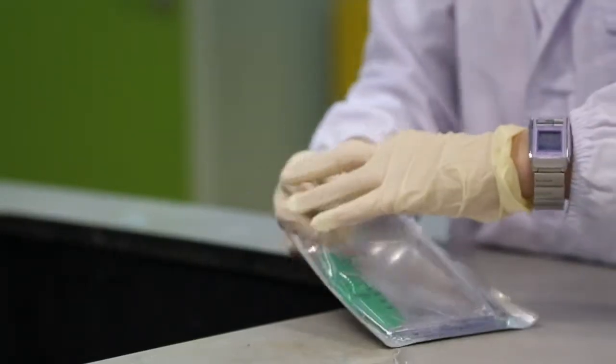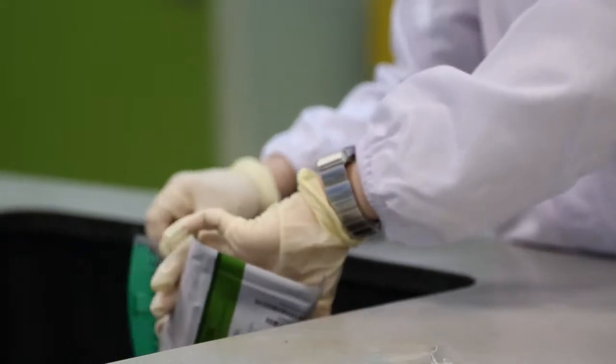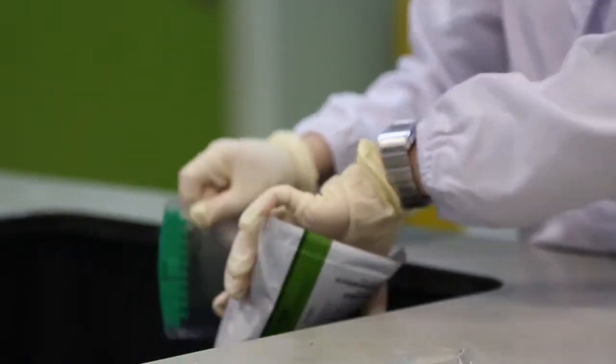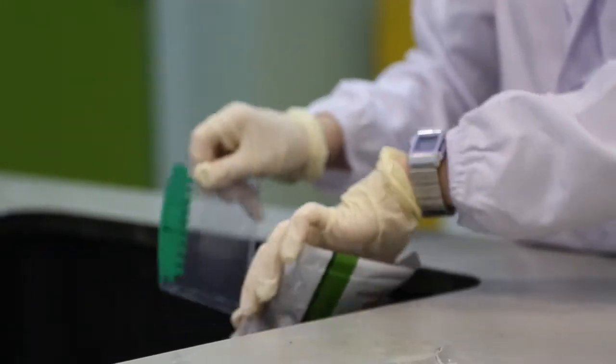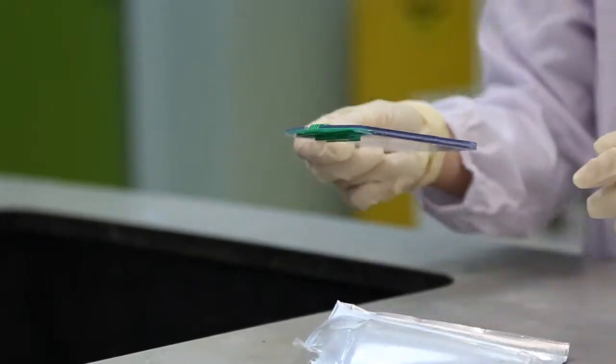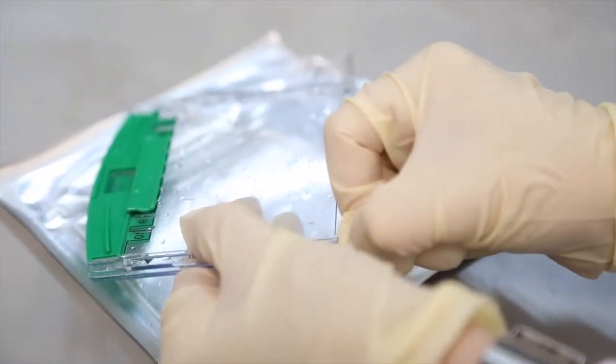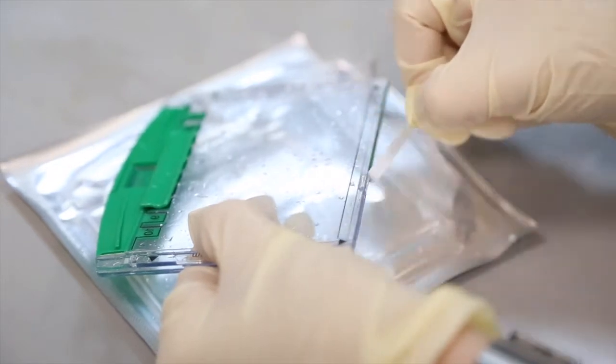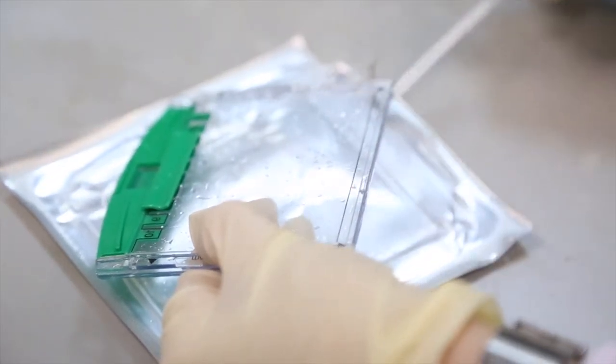Meanwhile, remove a piece of ready-gel cassette sandwich from the storage pouch and cut along the line at the bottom to expose the bottom edge of the gel. This ready-gel cassette contains polyacrylamide gel, which is the supporting medium for this experiment.